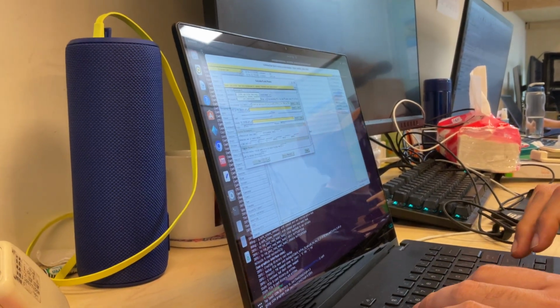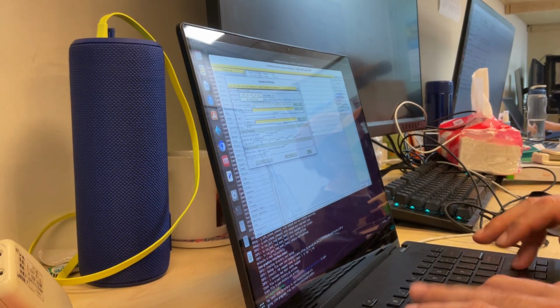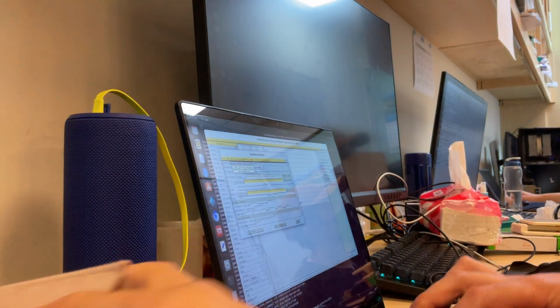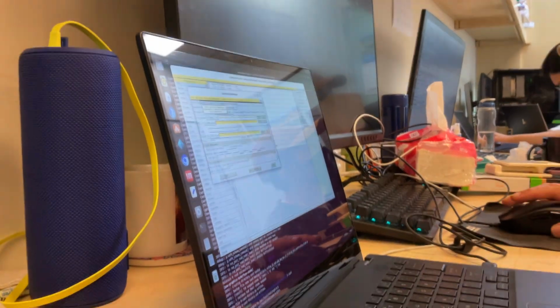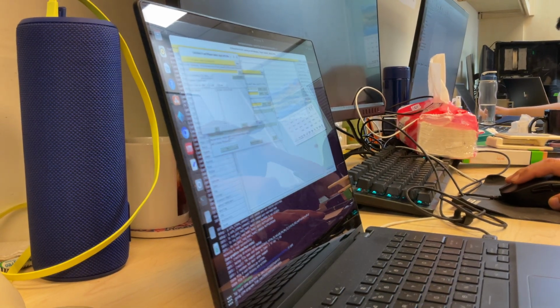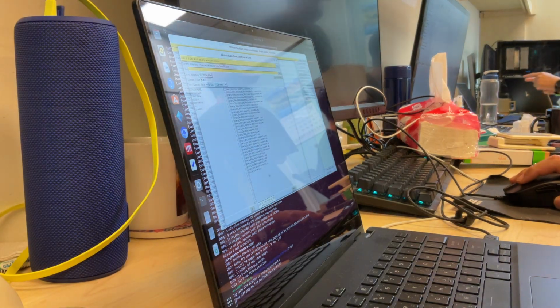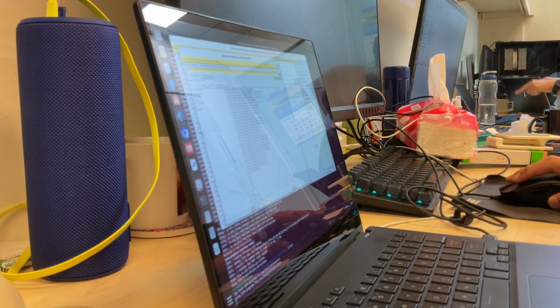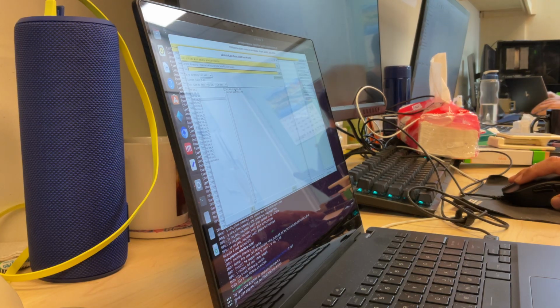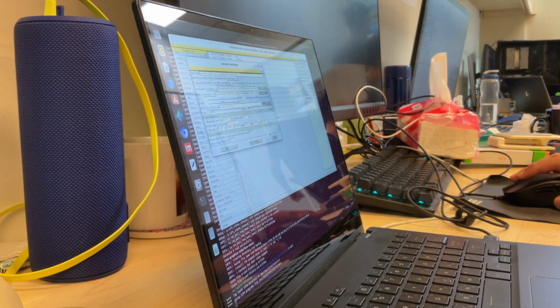Generate model F. So generate all dark FCs for scaling and extrapolation. Okay. And now the MTZ in is of course the raw MTZ file. Yeah, I think so, they should be here, isn't it? All dark RefMac 1. Nope. Where is it? It should be in all dark. All dark truncate. Yeah. Okay. And we call it all dark underscore SFO1. Okay, that sounds good.